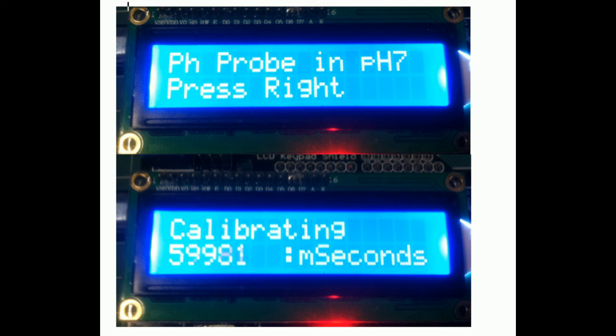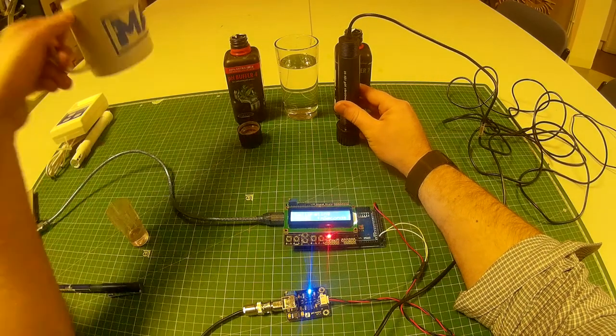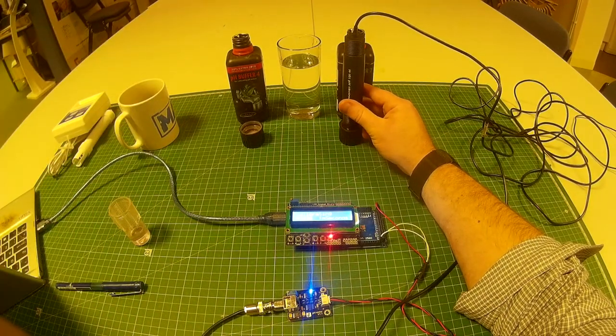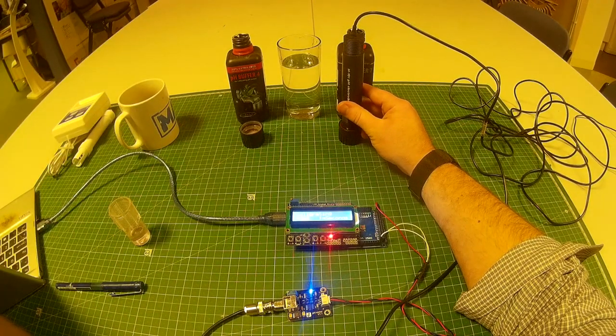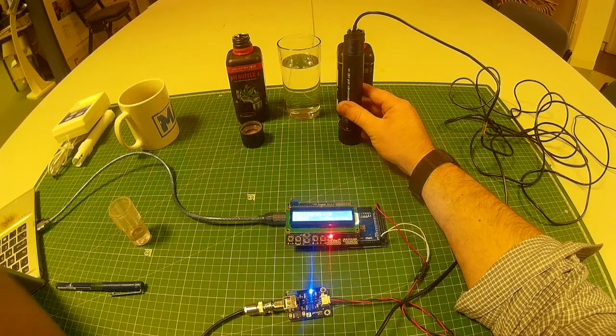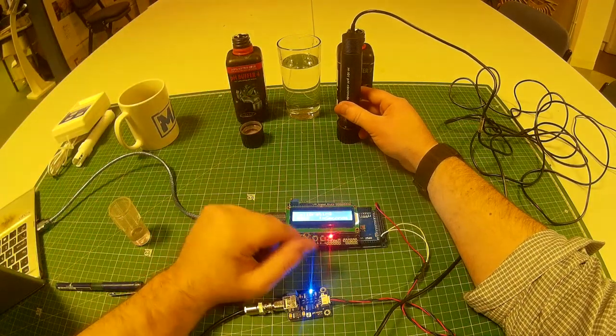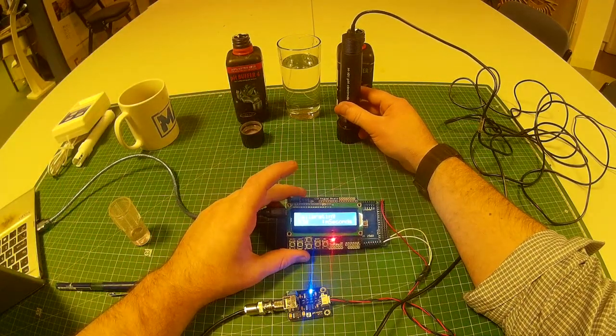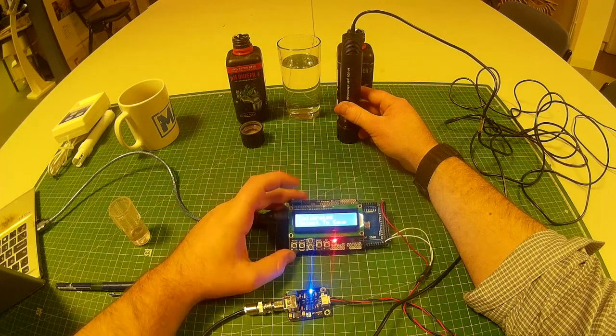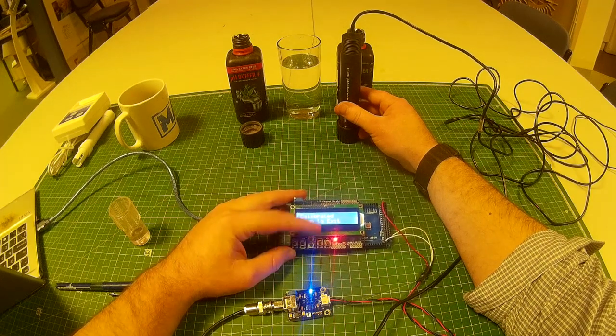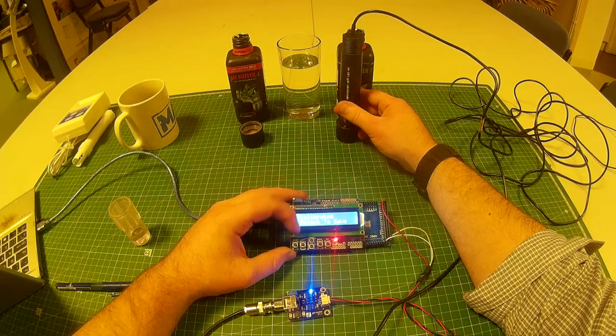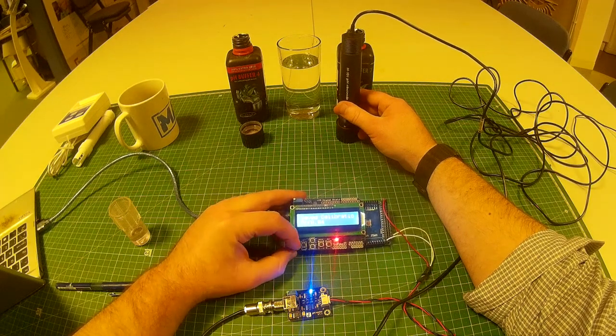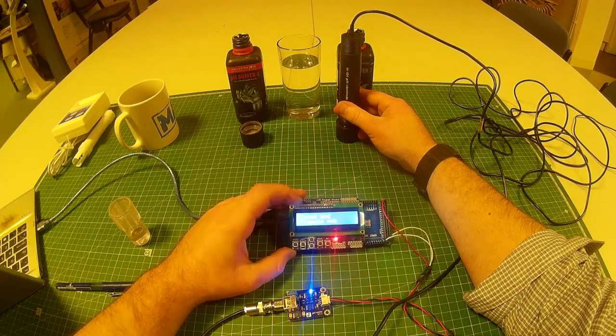Is the probe in pH 7? Right. So now it's just counting down the timer because to get a good calibration we need the probe to be in the liquid for 60 seconds. And now the timer's coming to an end. So it's calibrated. Select to save, down to exit if you don't want to or you put it in the wrong pH. So we'll hold select. And it gives us our offset.